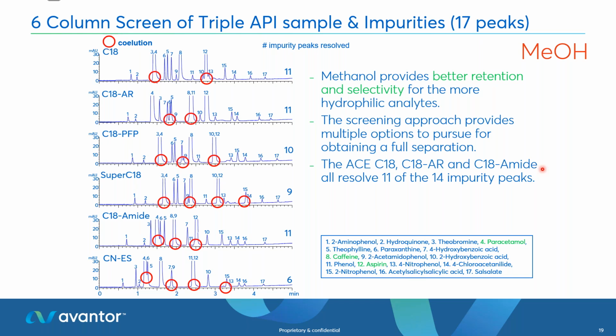They showed the best selectivity, and methanol again showed the best selectivity in this case for this mixture of 17 analytes.